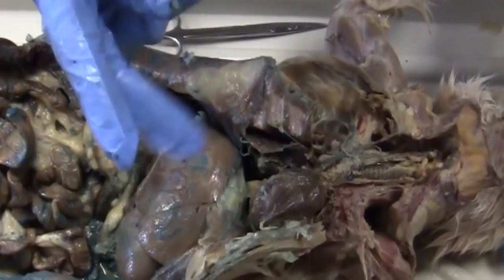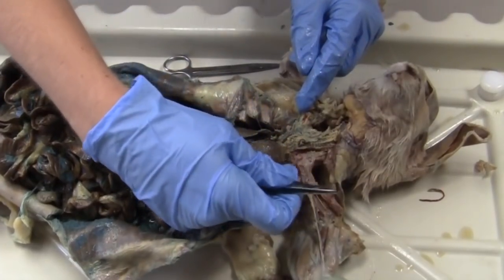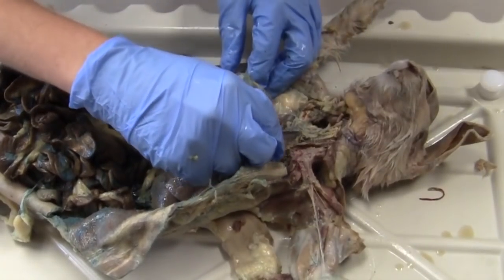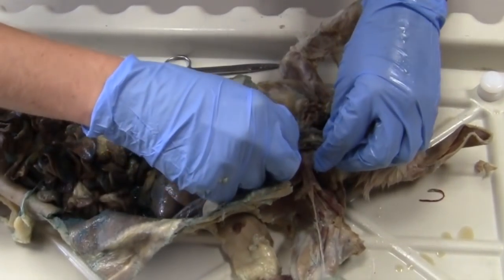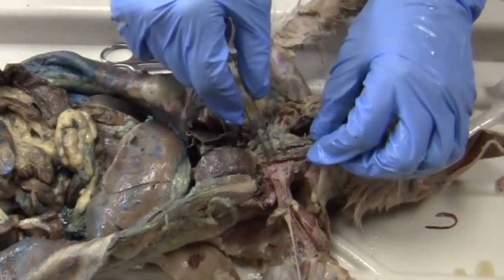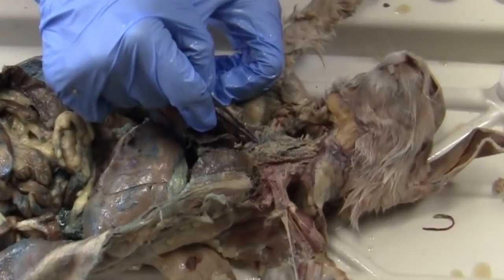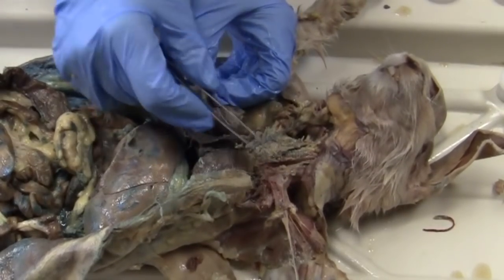The cranial vena cava, back up to this vein, has two veins coming off of it. And it's the same vein, but just different sides. So we have the left brachiocephalic vein and the right brachiocephalic vein. And actually, I kind of cut mine just a little bit over here on the left side, just because I was really trying to clean it up to get to the arteries on this side. But you have cranial vena cava, this, and then it would come off of this and actually curve over and go this way to the left side.